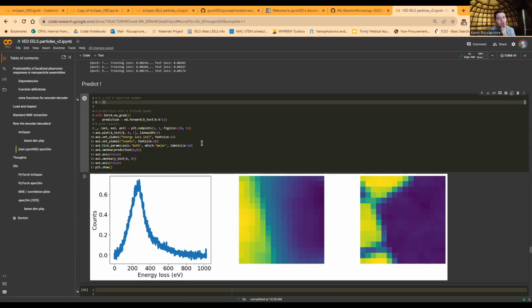What's very peculiar in this data set, however, is that this spectrum here should not have been able to predict that the particles were on the left side. Notice that this is really just, you're away from the particles at some distance. That's really all you should have been able to get from this spectrum. But somehow it knows that, or maybe it just got a lucky guess that the structure is on the left. It's not exactly the right structure, and there's some gaps between particles, but it somehow realized that it's on the left. And how is that even possible?